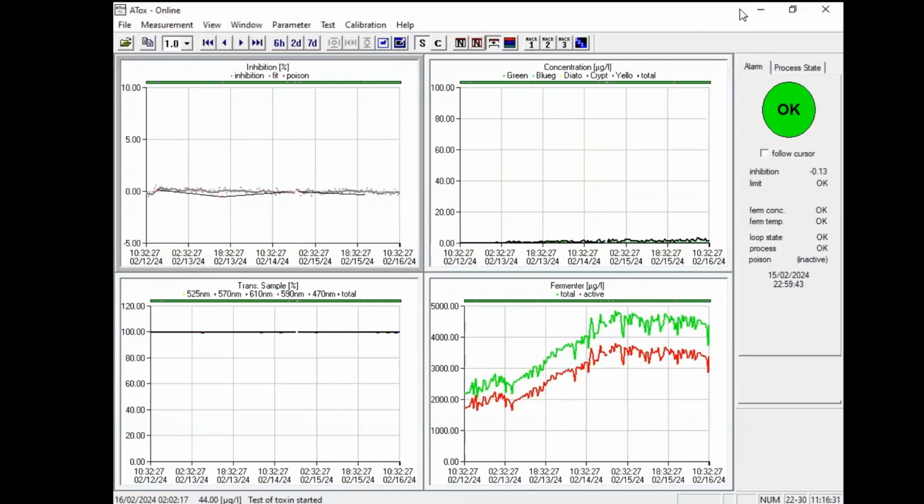In the normal process, after all the measurements are finished, I empty the sensor. Empty sensor means it's pressing air into the sensor, so the sensor is more or less empty with some remains of dirt.